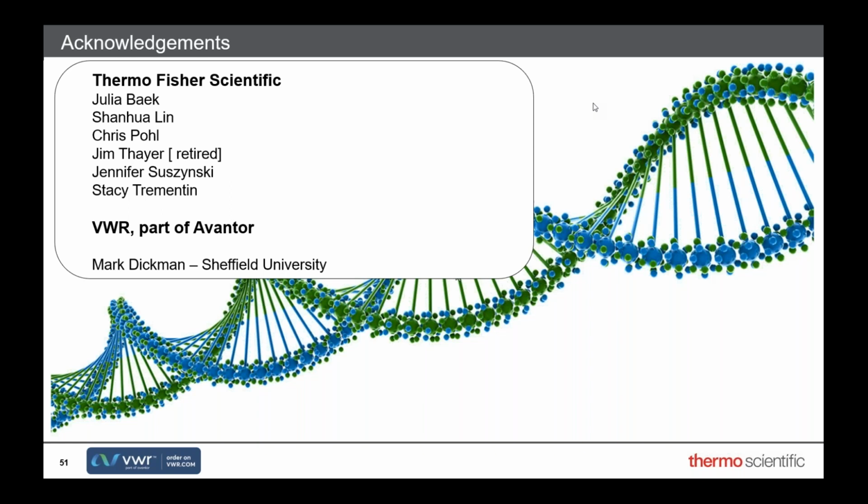Next question: what would be your suggestion for the separation of 100-mer oligonucleotides with MS compatibility? For that one, again, you've got both options. If you really want to look at the separation, you'll get some powerful quantitation of impurities by UV.